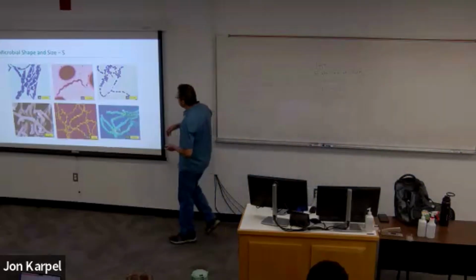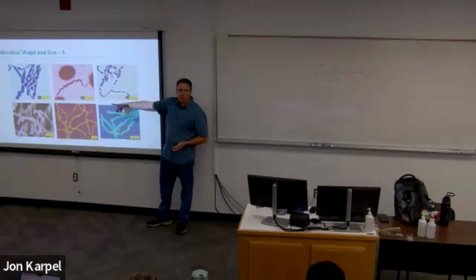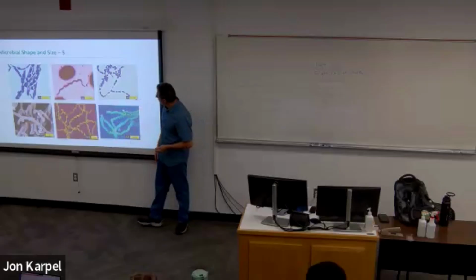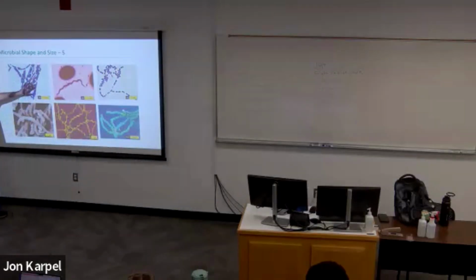So we're going to do some gram staining. That's probably the most well-known differential stain, and it's what we're going to use. We do gram staining, but just look at, one of my favorite words, the plethora of different cell structures that we can see. You guys know that word?